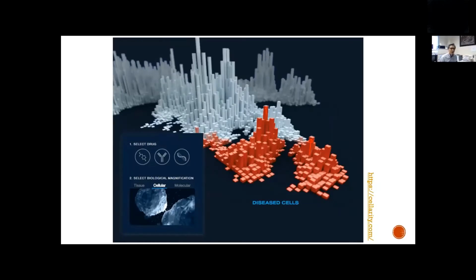So sooner or later, you will have time to play with real data. You will have a deeper understanding. How can you show this three-dimensional data? You have a position of a cell. You can put the position of a cell in 3 dimensions, and you can color each individual cell by a certain gene's expression level. If it's darker, then you think gene A's expression level in the cell is higher than a lighter color. And that's the data processing. I will show you examples later.